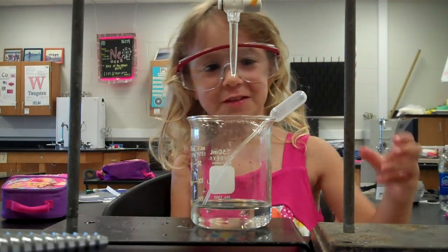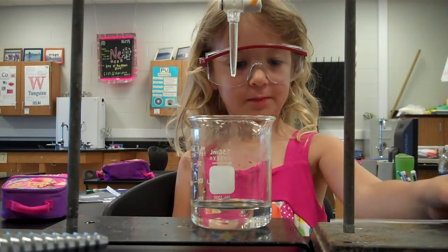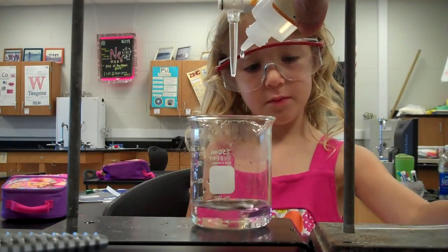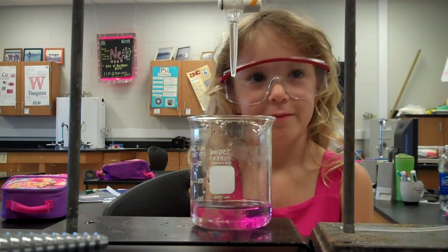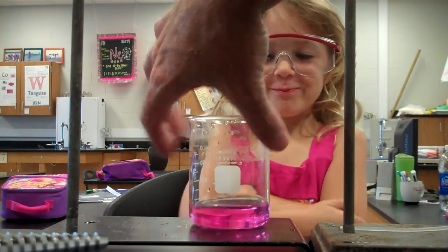Let's see if Daddy can get it to turn back. Let's put some sodium hydroxide in there. I think it's going to turn pink again. I think you are thinking very smartly. Let's see. Pink — oh, there it is.